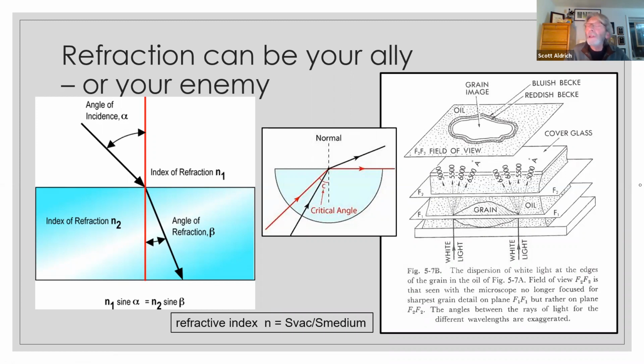When we get really close to matching the refractive index of the solid and the liquid, all of a sudden the different wavelengths of illumination start to behave differently. You start to see the differences and you start to split apart the component wavelengths of that white light into discrete colored elements.